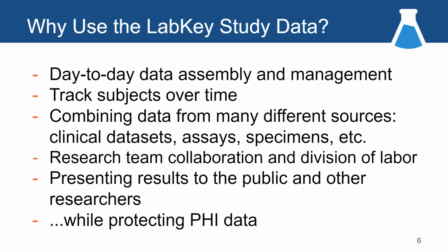You may have medical histories, clinical observational data sets, laboratory data that came out of some assay or some experiment, specimens, etc. All of these different kinds of data sets have different shapes. They all need to be hooked together in some way and analyzed together. LabKey's really optimized for that kind of a problem.